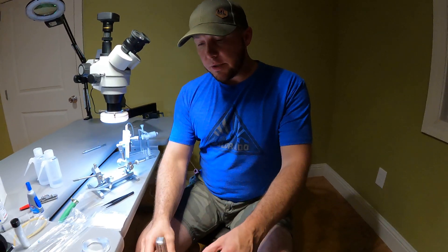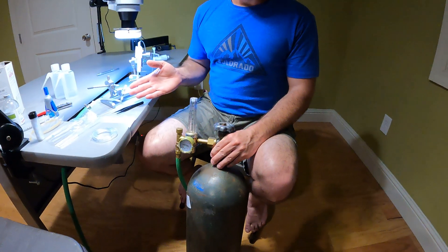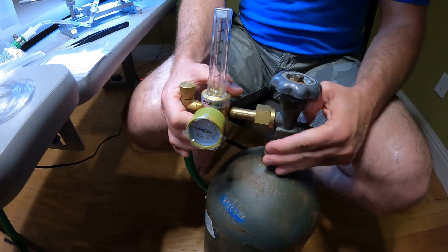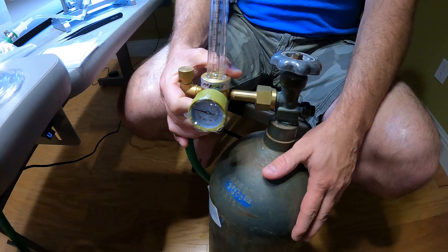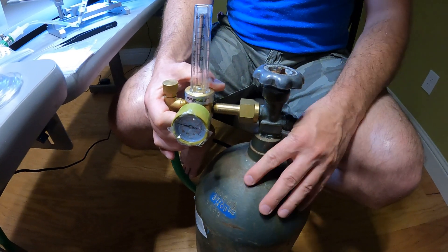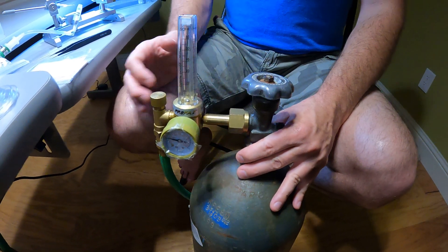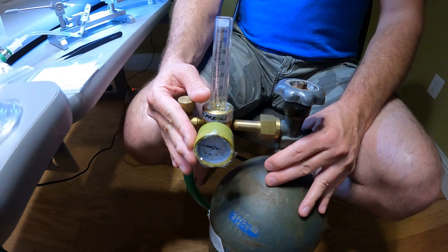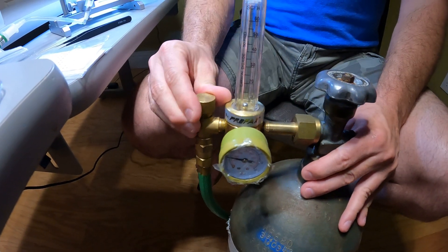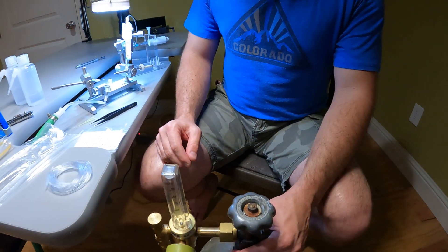I didn't cover my CO2 setup yet. CO2 anesthetizes the queens and also stimulates oviposition. I have a big bottle here — they also have miniature setups with smaller cartridges and little regulators. This is just a CO2 tank and a flow meter I got at a welding shop. You can turn the gas on and operate it very efficiently, letting just enough through to anesthetize your queens.